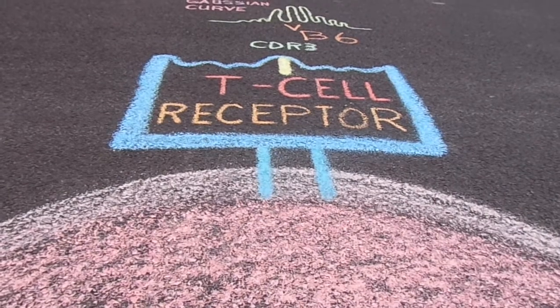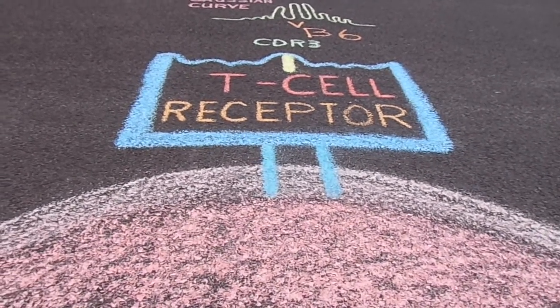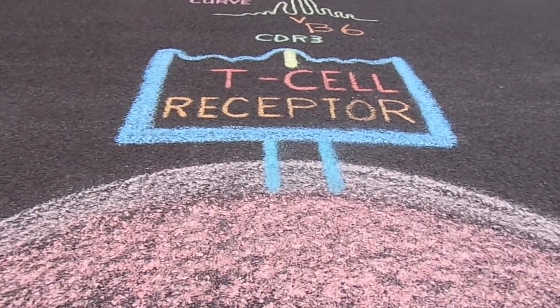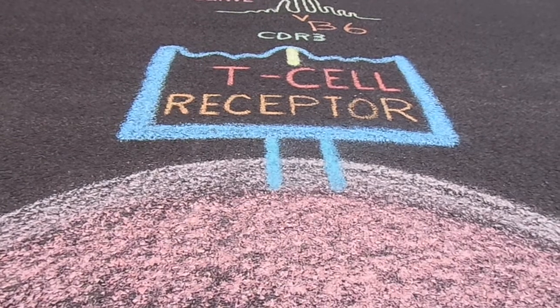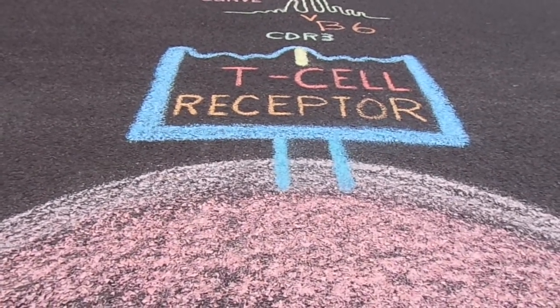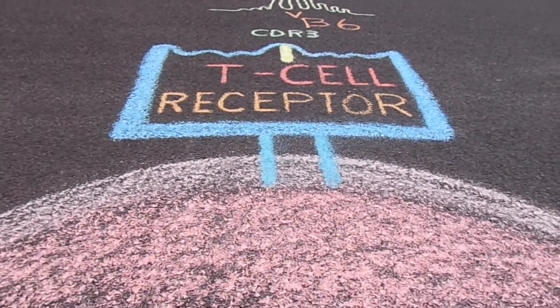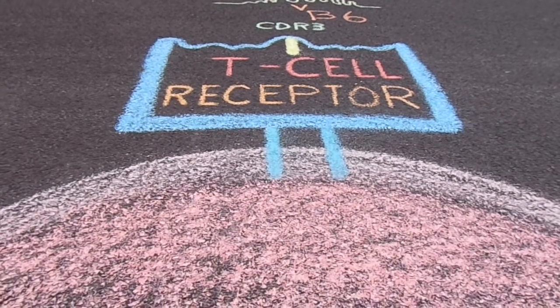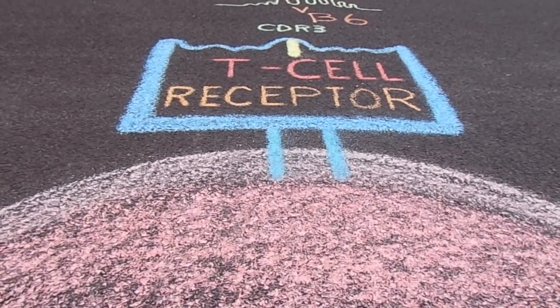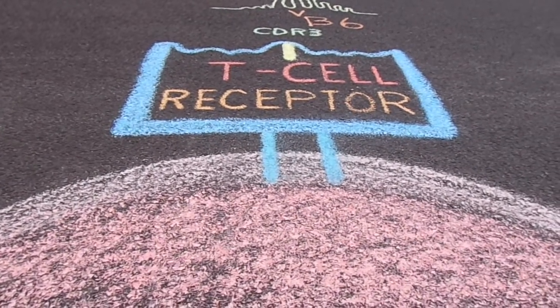This information has usually been obtained through the laborious process of cloning the T-cells involved in specific responses and the cloning and sequencing of their T-cell receptors. It is possible, however, to estimate the diversity of T-cell responses by making use of the junctional diversity generated when T-cell receptors are created by somatic recombination, a technique known as spectratyping.